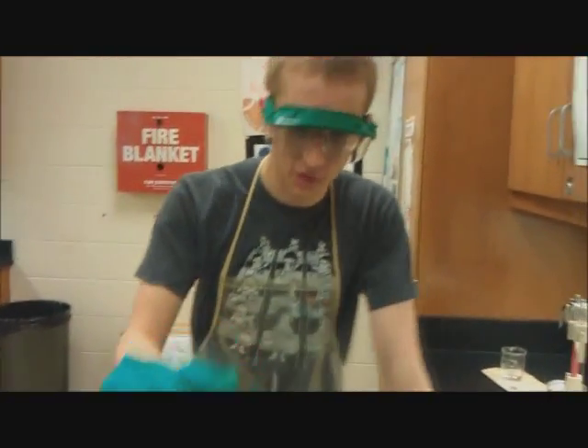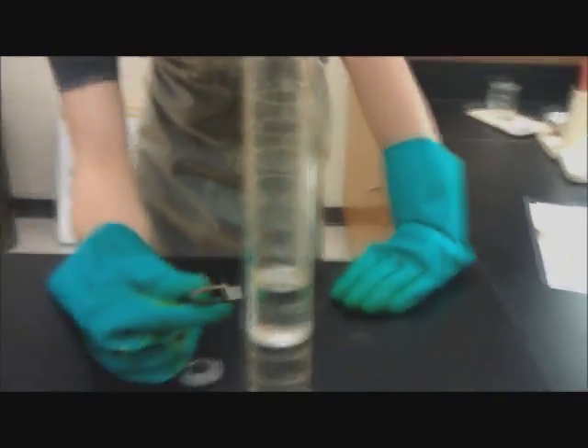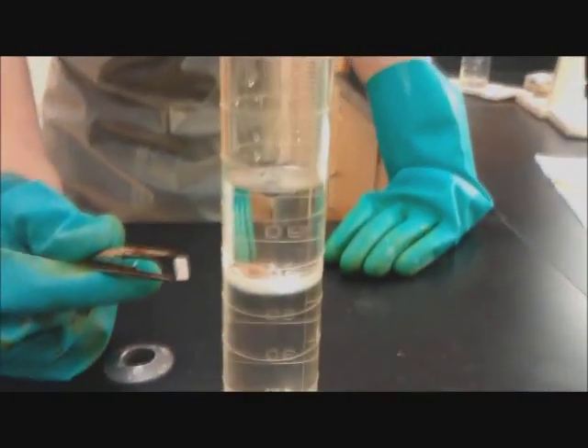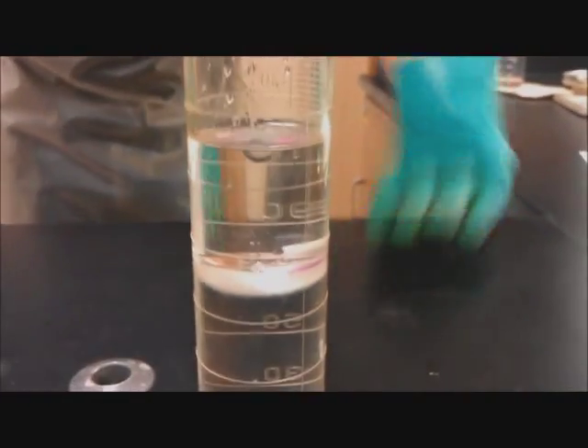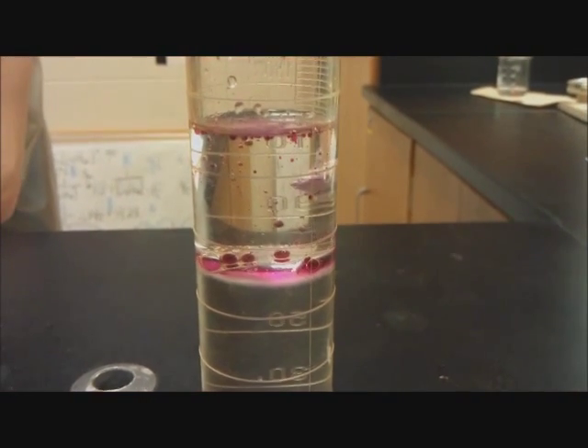We're going to take the sodium and drop it in. It'll be inert with the mineral oil, but as soon as it touches the water, the phenolphthalein that's in there is going to turn pink because we're producing sodium hydroxide, which is a base. Bam — as soon as it touches, it turns pink.